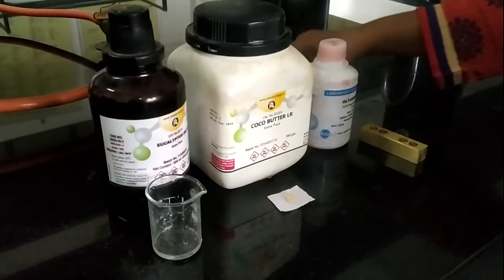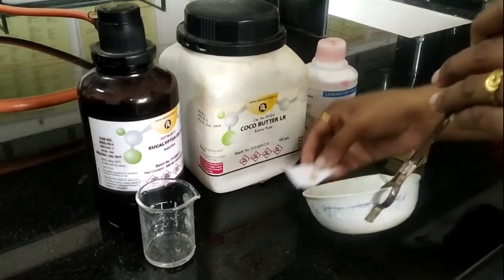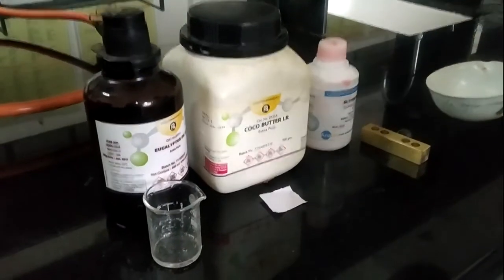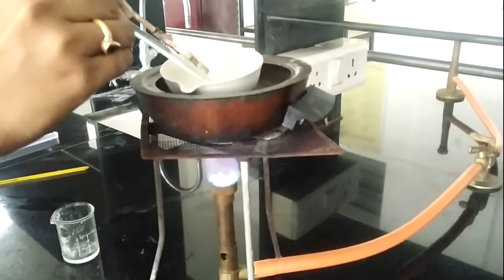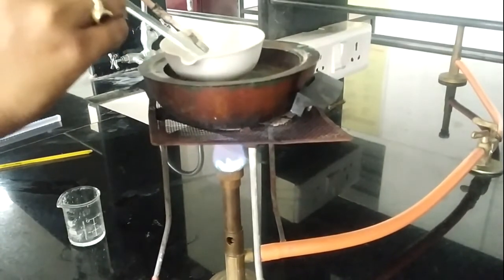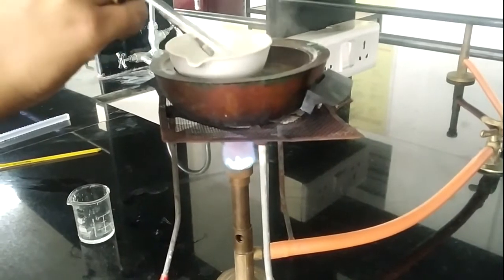First of all, I am going to take this cocoa butter into this evaporating dish and then proceed to melt it to form the theobroma oil. We have started the melting of this cocoa butter.